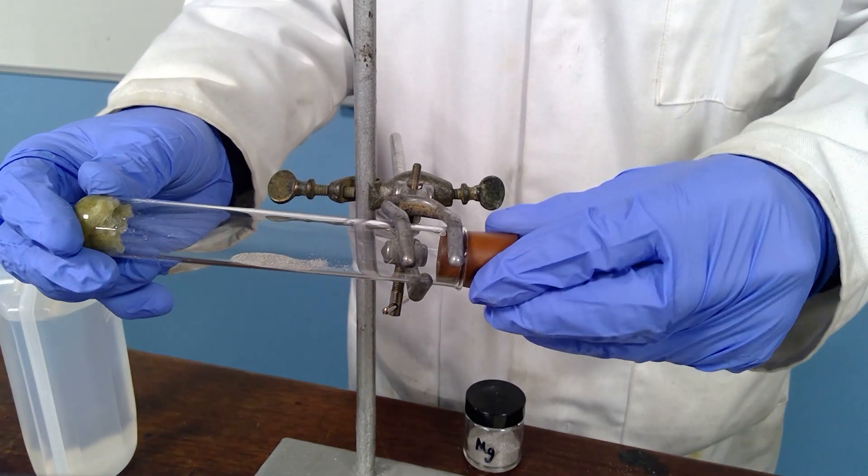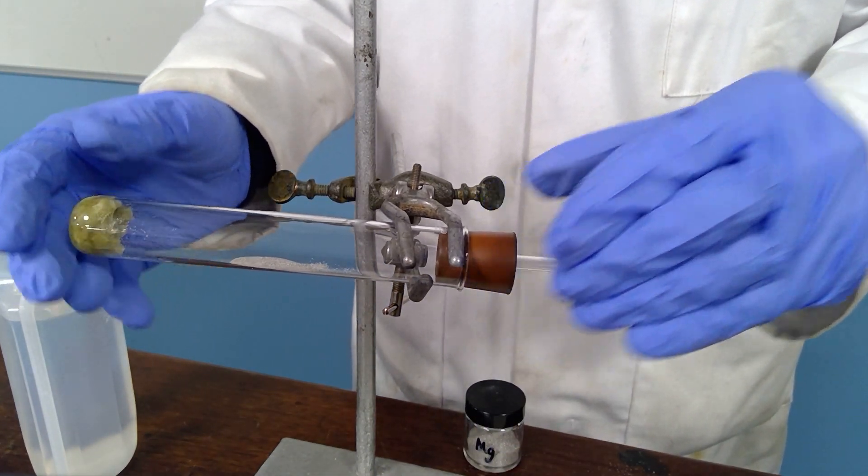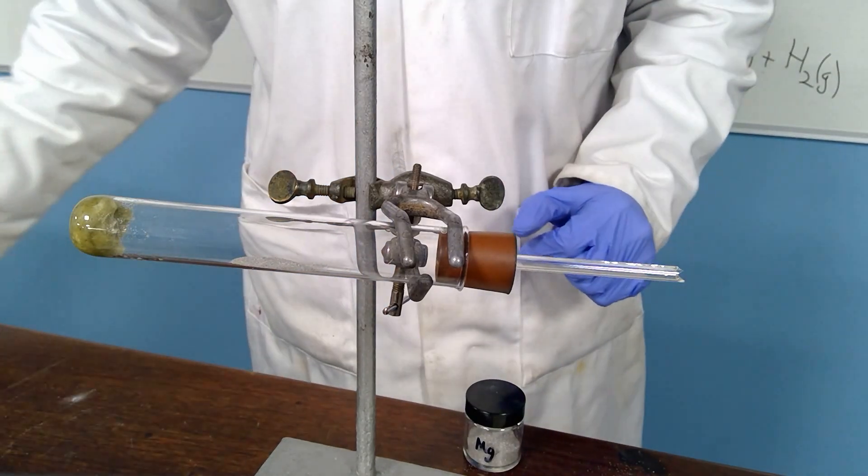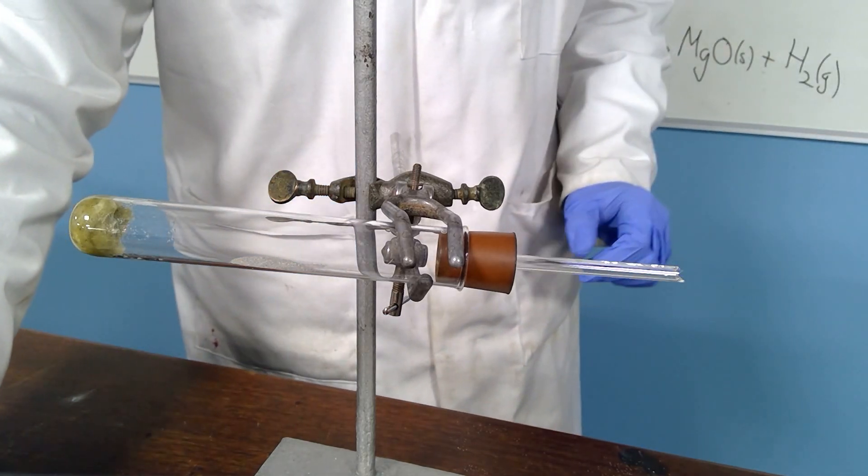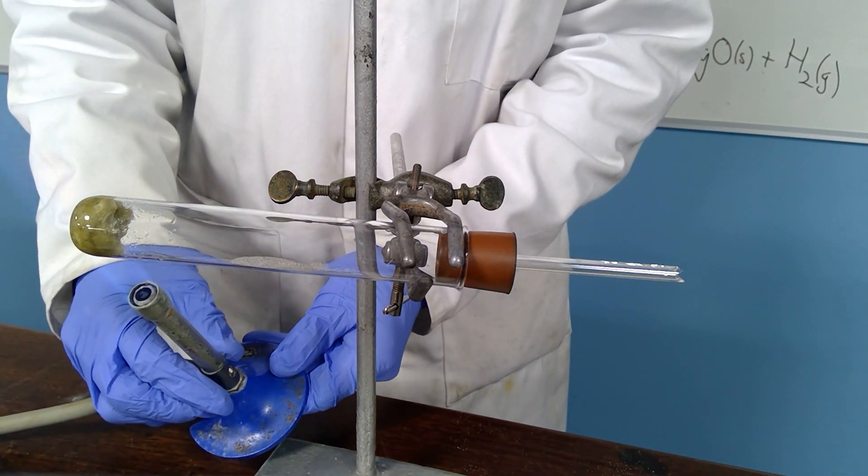I'll place the delivery tube back onto the boiling tube and we'll heat this combination. So first of all, I'm going to heat the magnesium.